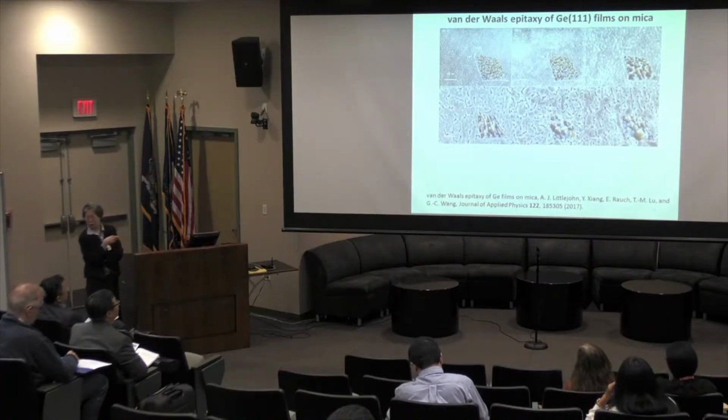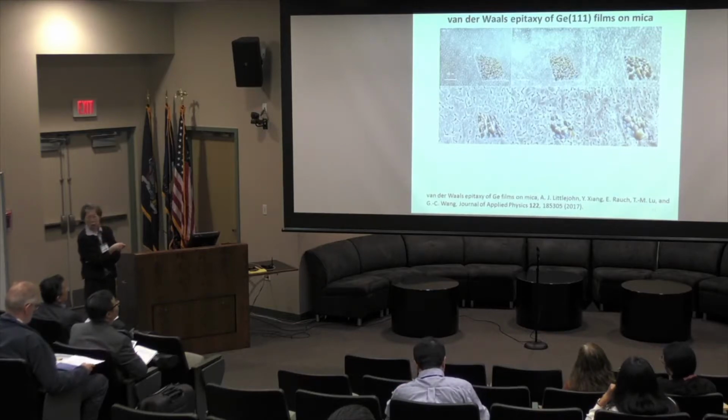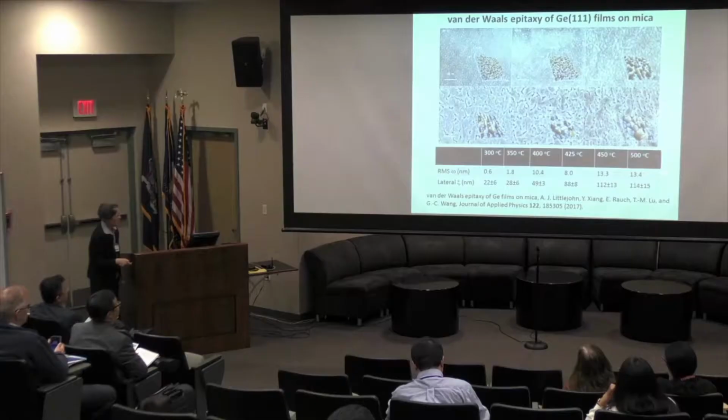Looks like it's rougher, right? Looks like some lateral feature also gets larger. Agree or not agree? Okay. But my question is, can we quantify it? Okay. So actually, you can quantify it. So those are the results.